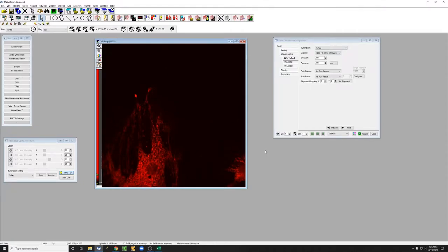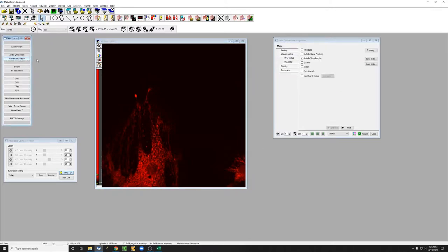For the rest of this video where I discuss how to acquire a multi-channel image, I'm going to stick with the Hamamatsu flash. So let's just go back to that one.